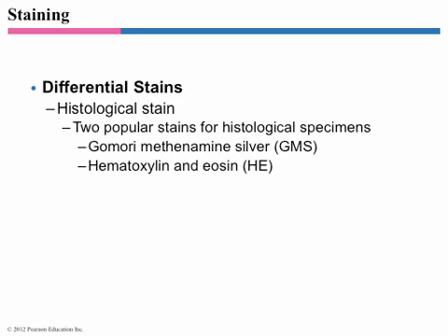You'll need to know it. It'll be on the test. But the Gram stain is basically going to tell the difference between Gram-positive, thick cell wall bacteria, and Gram-negative, thin cell wall bacteria. And it's a differential stain. You have two colors on the same slide at the same time, and they're going to differentiate between two different things. So it's a differential stain.